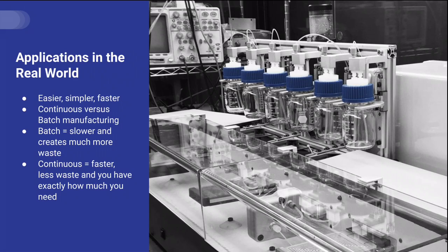This is especially true for the pharmaceutical industry, which relies on automated chemical synthesizers to keep up with demand, as the amount of chemical syntheses that needs to be done is unattainable by hand, but by using a machine, this project is exponentially faster, easier, and much more efficient.